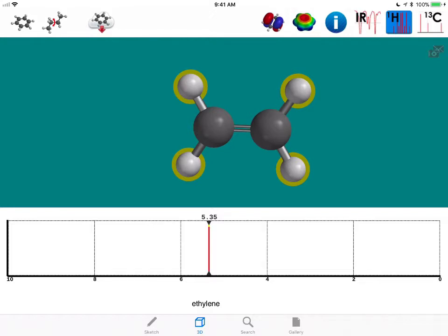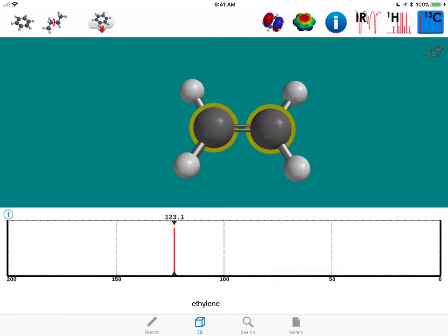And now if we look at the carbon NMR, we have an SP2 hybridized carbon. Both carbons are the same, so we see one peak. And the chemical shift at that peak on this simulated spectrum is 123.1 parts per million. Again, that's a significant shift away from an SP3 hybridized carbon, which was between about zero and 20 parts per million.